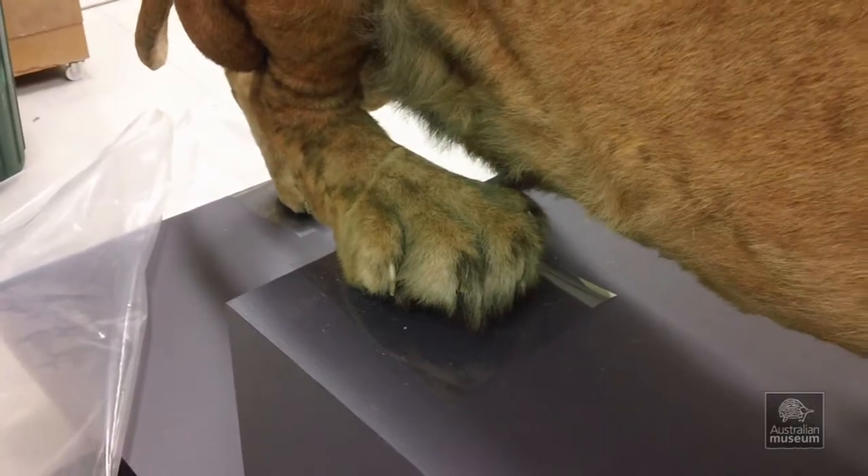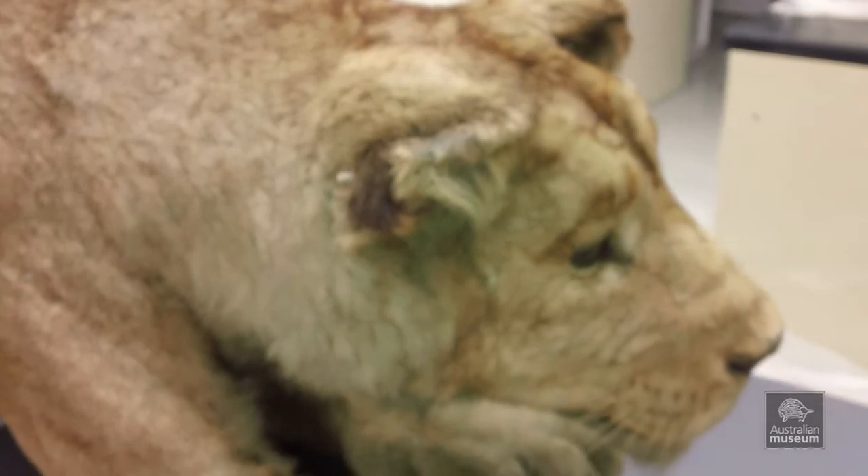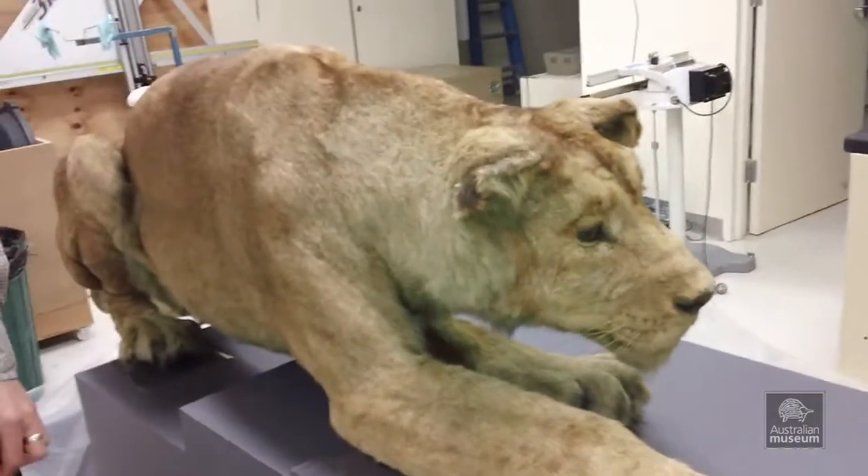The results are very handy for us because we can know definitively whether you can interact with the specimen. And it's very handy for the preps when they have to go in and put a new mount onto it.